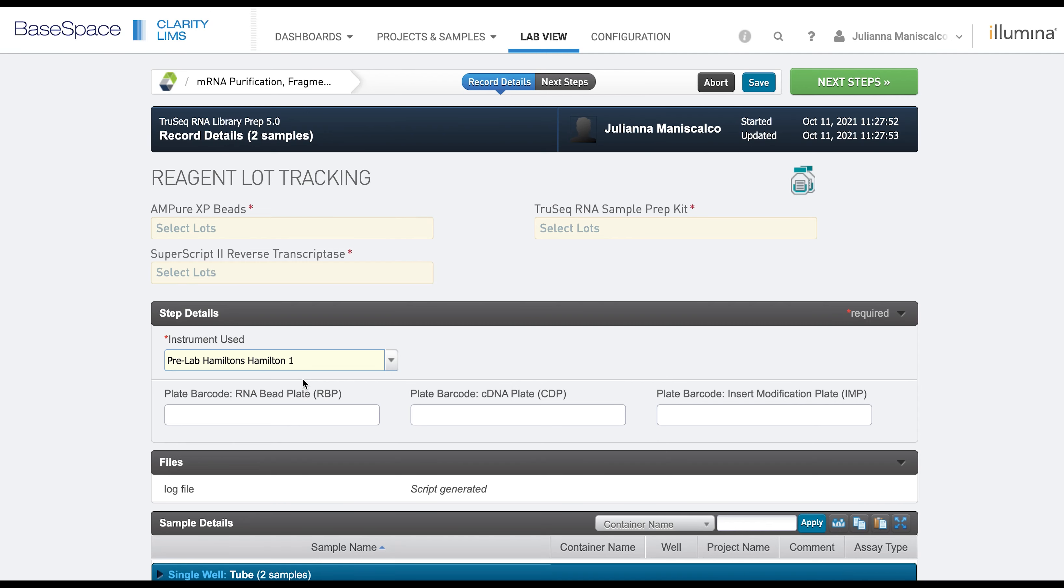Being able to track which instrument has performed which step on which specific samples will help to troubleshoot and analyze your preps over time.